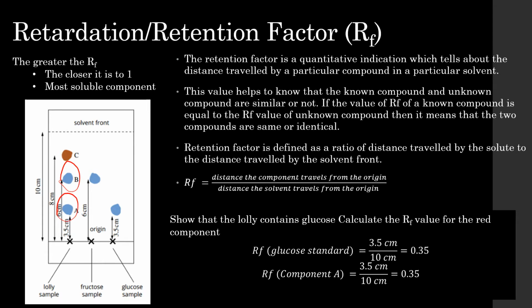Now, if I were to compare that against a known standard of fructose, for example, I can see that, oh yes, that B component is the same as fructose, and the A component is the same as glucose. So I can see that this lolly has both fructose and glucose in it.